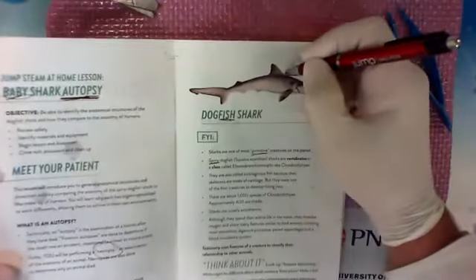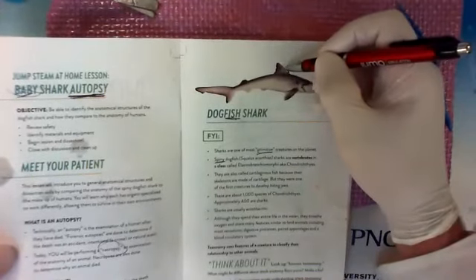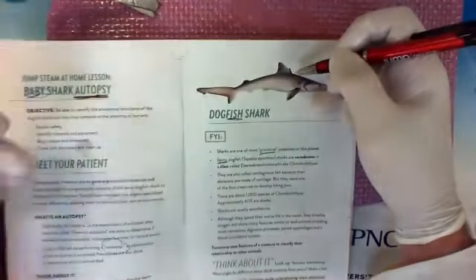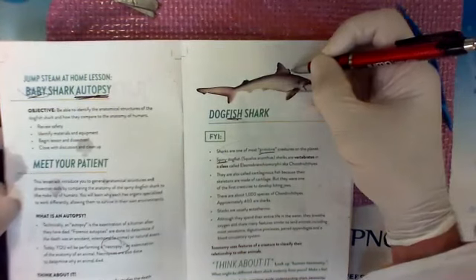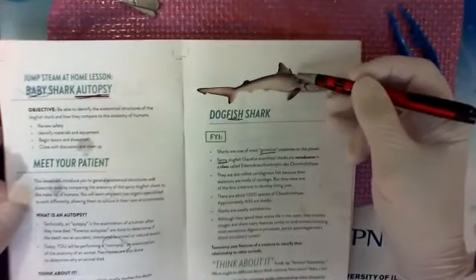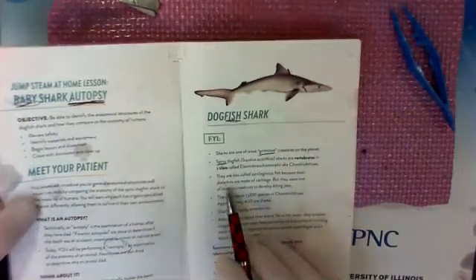Spiny dogfish. When you look at it, there's going to be a little piece of tissue missing here and a little piece of tissue missing here. Because just like a catfish, if you ever caught a catfish, there's a spine that goes off the dorsal or the back of the dogfish shark that's filled with a toxin. So the fishermen remove that before they even send it to the place that packs these for us. So you won't see it, but you will see the little tube that's like a syringe or a needle for injection. And think about why, if you were a dogfish shark, you would want that spike there instead of somewhere where you could use it as an attack structure. But we'll talk about that too.